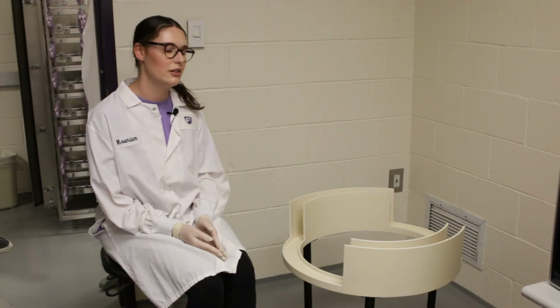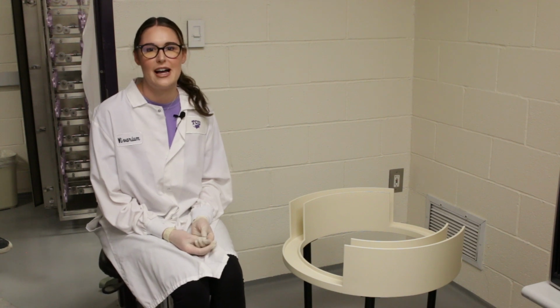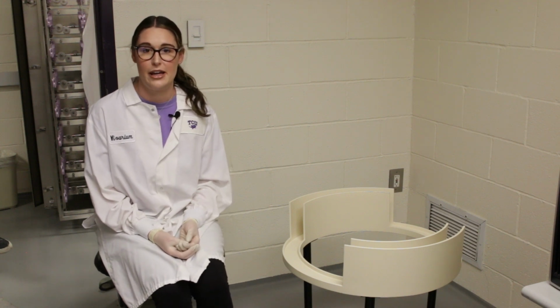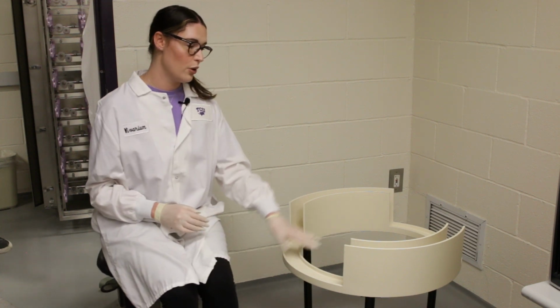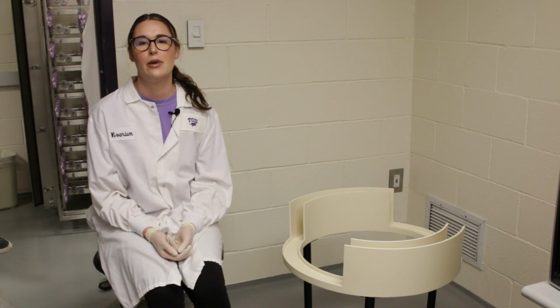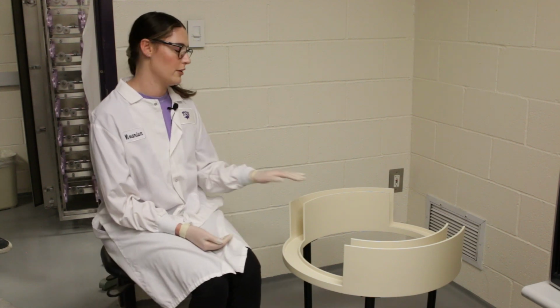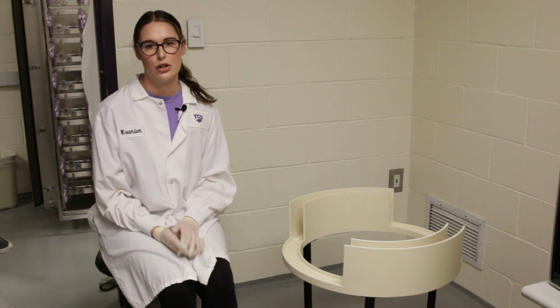This is our Elevated Zero maze, and we use this behavioral test to assess for anxiety-like behaviors. We have 2 closed quadrants and 2 open quadrants, and when the mouse is placed onto the maze, we measure the amount of time it spends within the closed quadrants in comparison to the time it spends in the open quadrants.